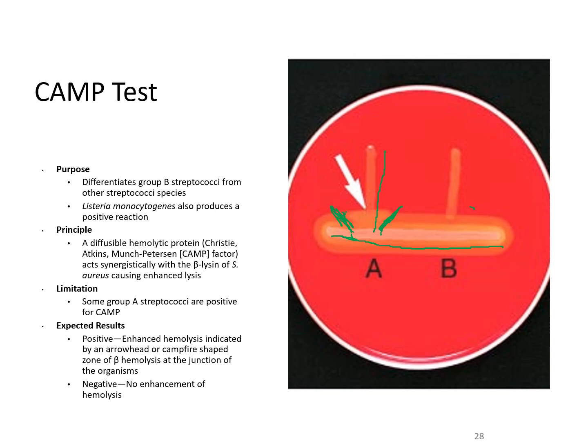And then a negative, you would not see that enhancement of that hemolysis. So this would be considered positive, and this is negative.